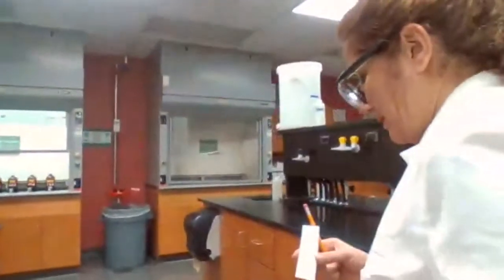So I'm going to take the TLC plate and place it under the UV lamp.